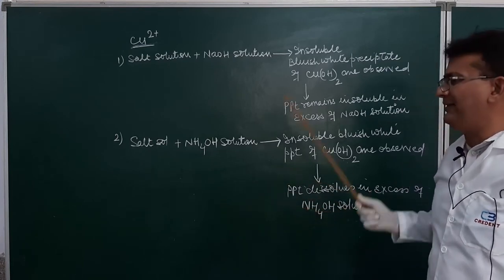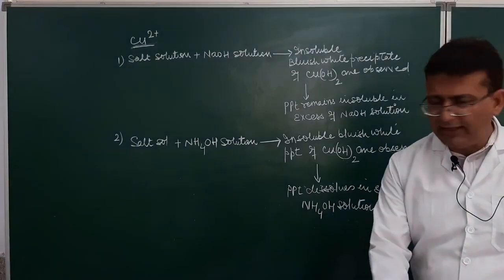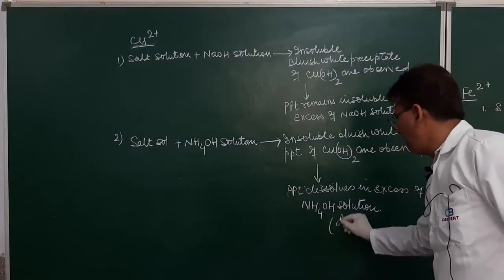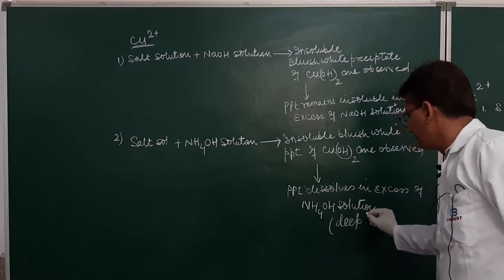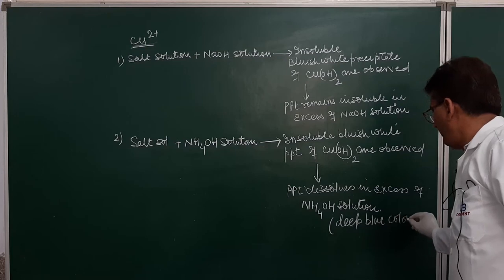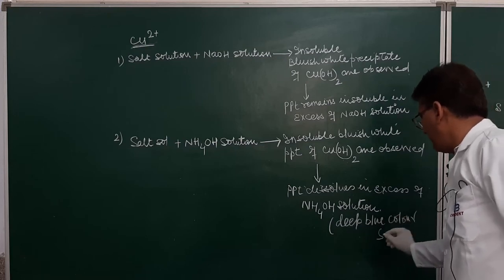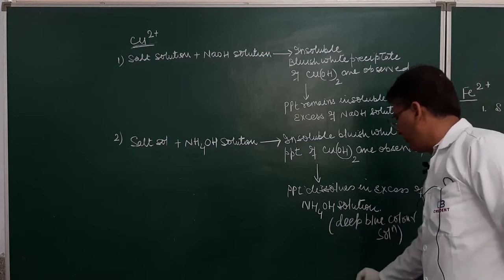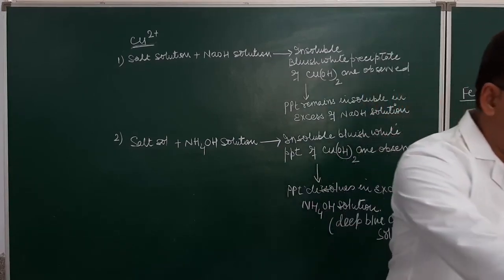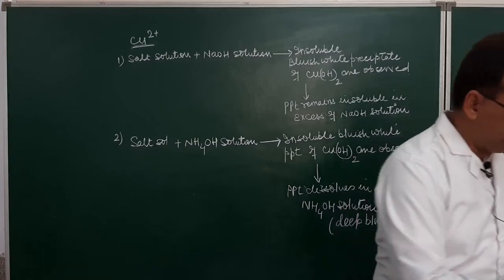But the precipitate in excess will be soluble, and what do we observe? In this case, a deep blue color solution will be observed. I think it must be very clear. It was already discussed with you earlier. Now we will try to do this one also.